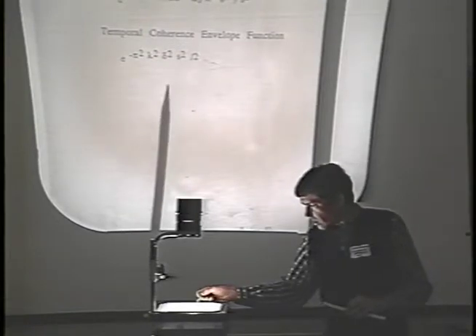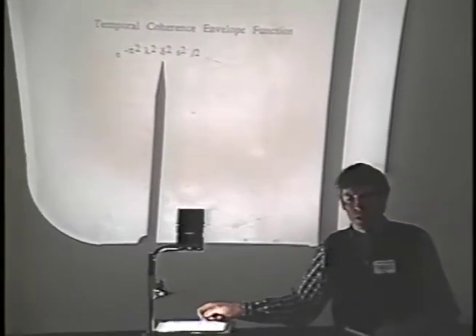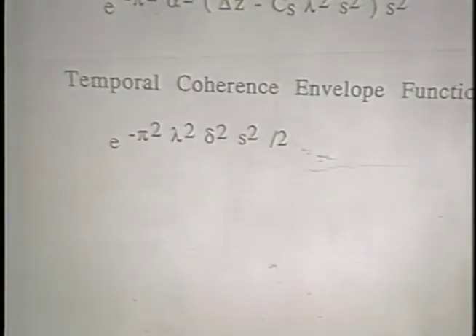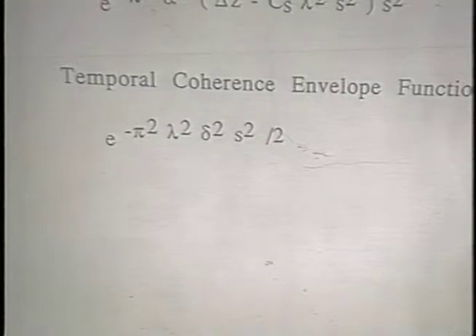And this little delta here is basically a parameter that reflects the width of the focus variations during the time that you're taking the image. So that includes instabilities in the objective lens current and instabilities in the high voltage.